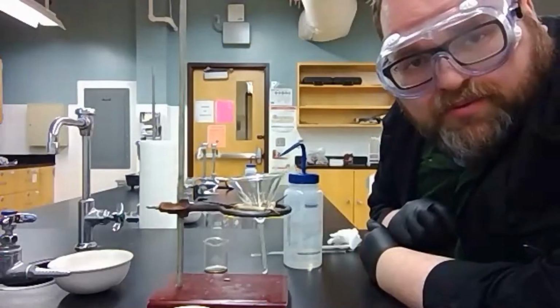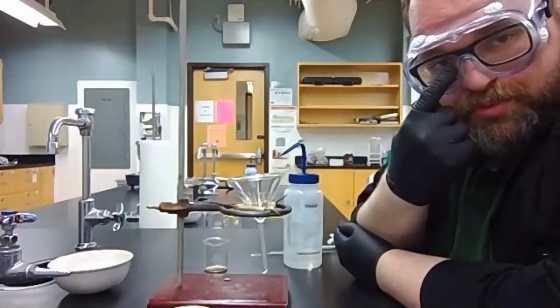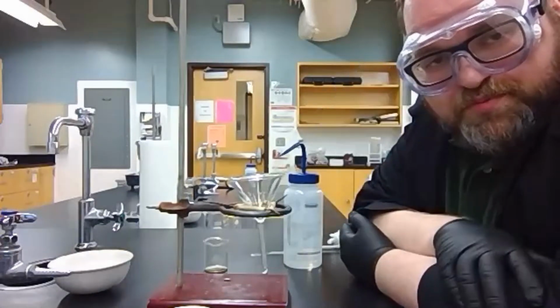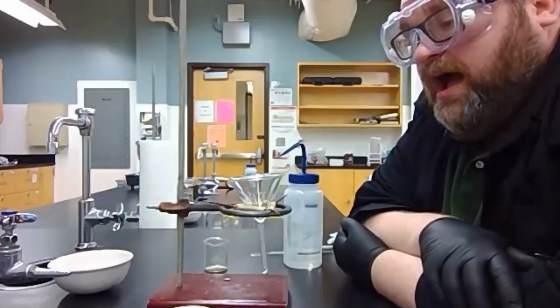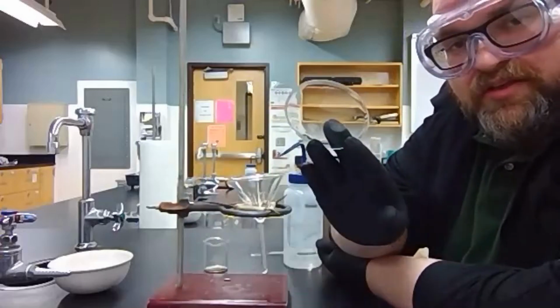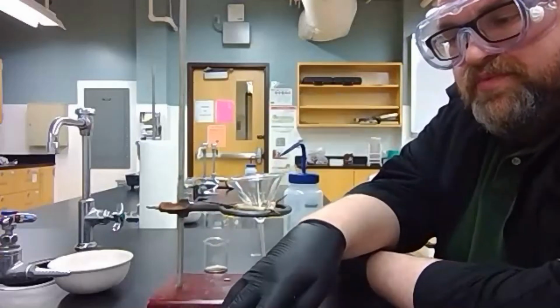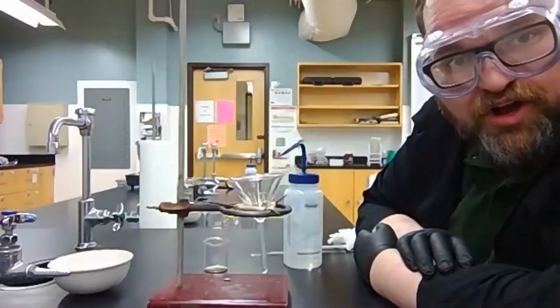Now, while I was gone, I got on the rest of my personal protective equipment: goggles to protect the eyeballs, gloves to protect the hands, and my lab coat to protect the rest of me. Okay? I also obtained the mass of the evaporating dish, the watch glass, and the filter paper. You will be glad you did this later on.